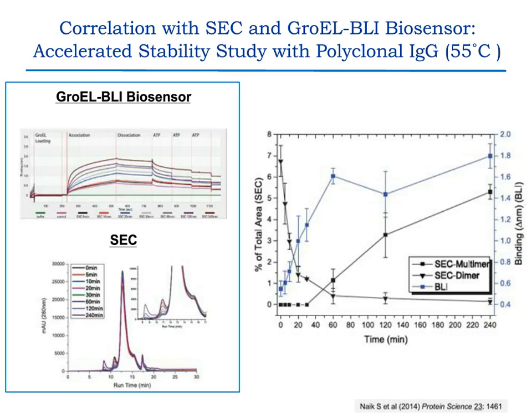And there was an increase in multimeric higher-order aggregates, and we could see a readout in the GroEL system before we see a readout by size exclusion in terms of multimer formation.